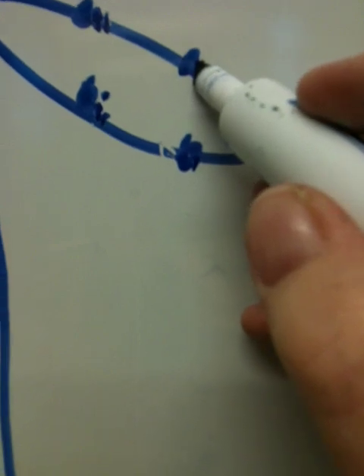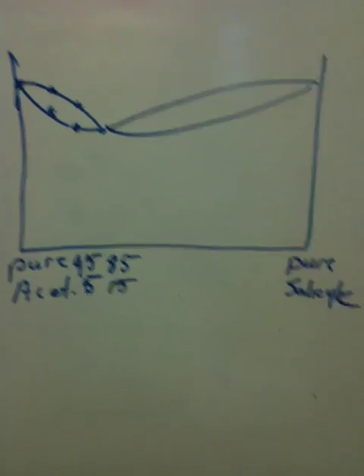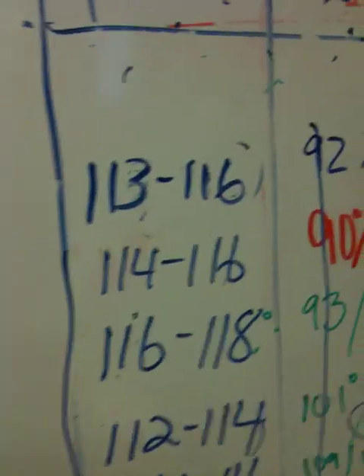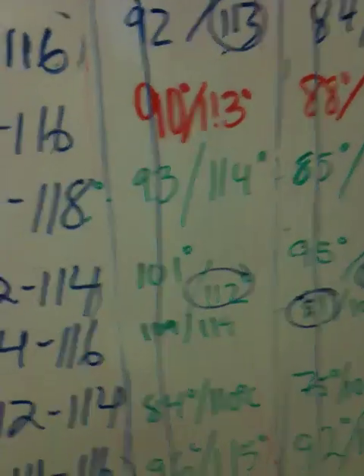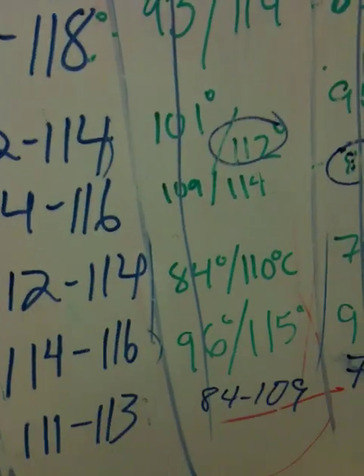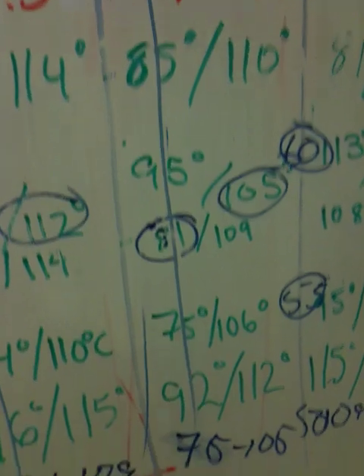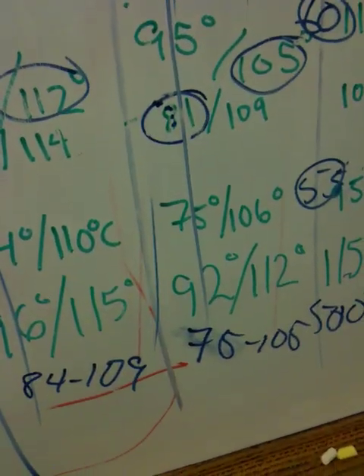for an 85.15, okay? So the conclusion we drew, so I'm backing up so you can see that graph a little better. It's not the most perfectly constructed graph. Okay, so the conclusion we drew was that there was a huge standard deviation on the beginning of melting, and this is because people have very different perceptions about what the beginning of melting is.